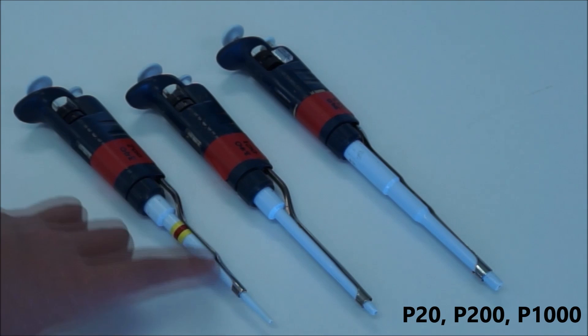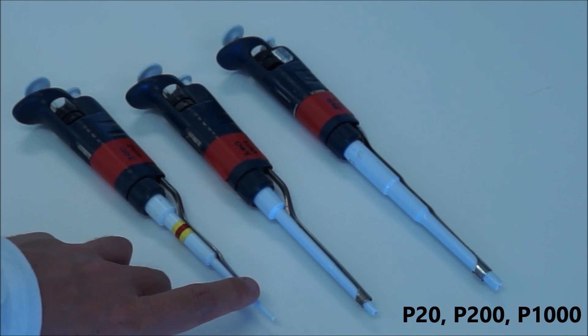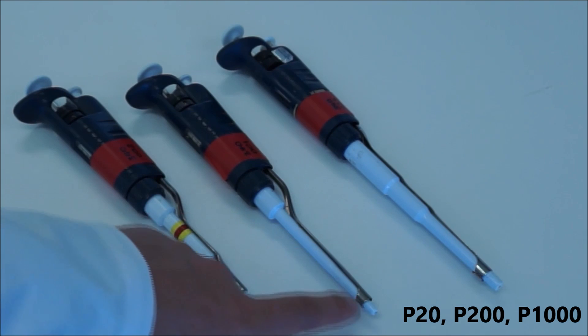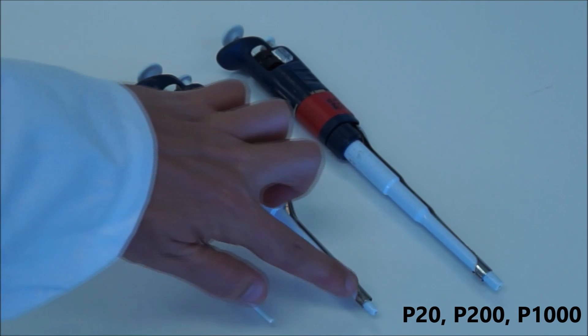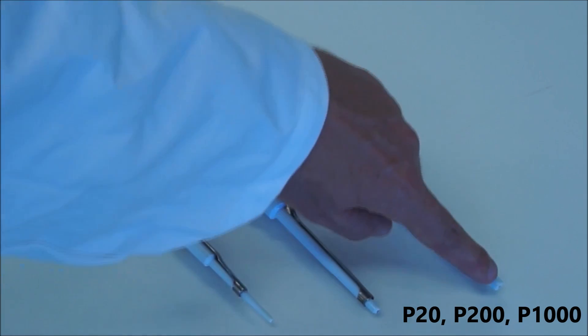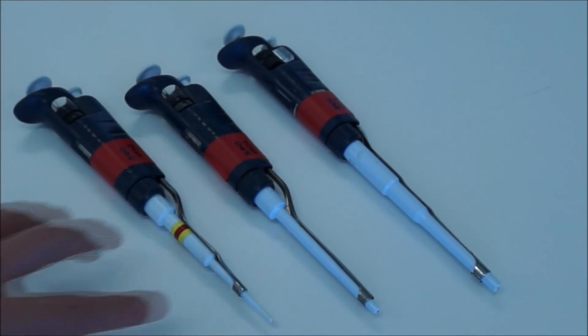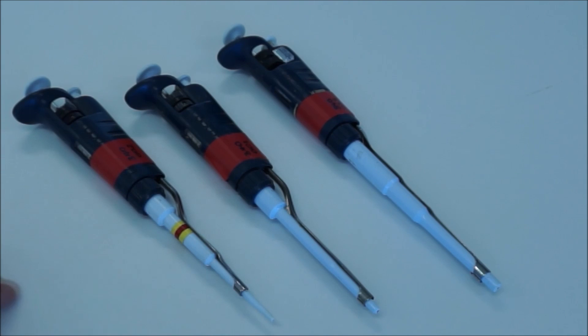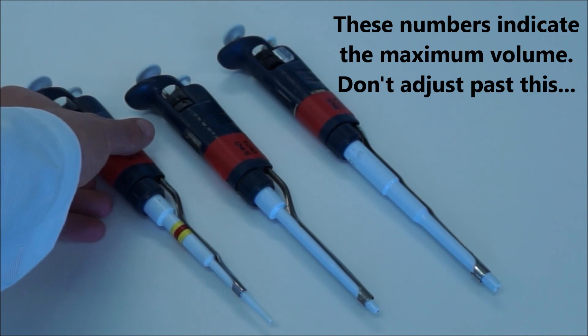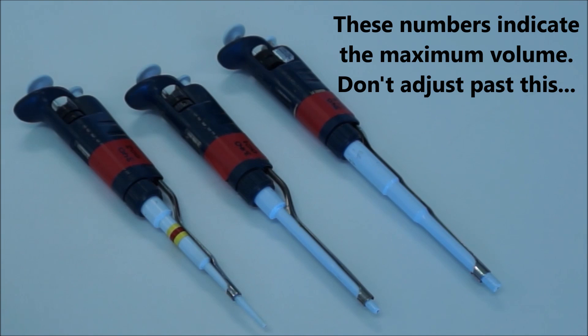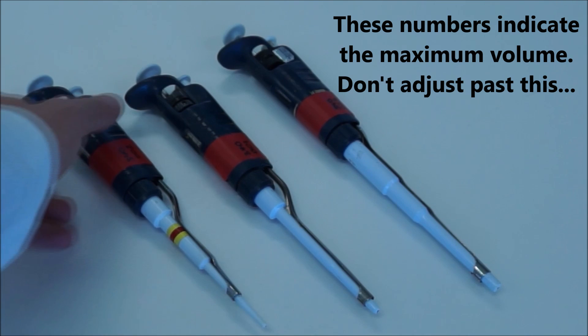There are three that you might see in the lab. The first is a P20, it's got a very long pointy end. The next is a P200 and it's got a snub nose. And the next is a P1000 which is quite wide. We'll be using mostly the P20.